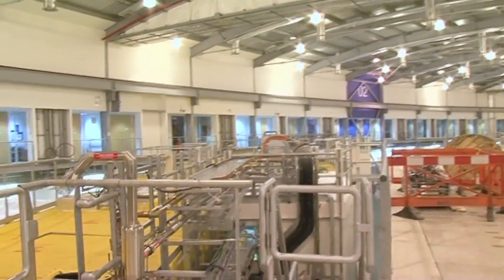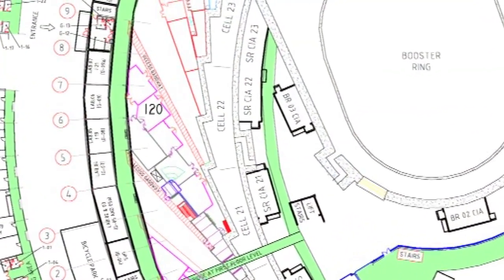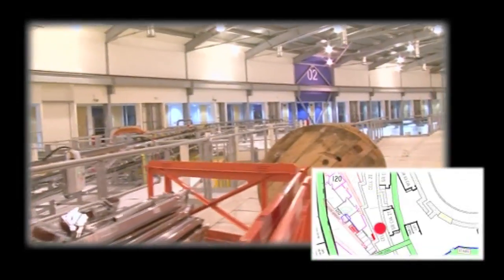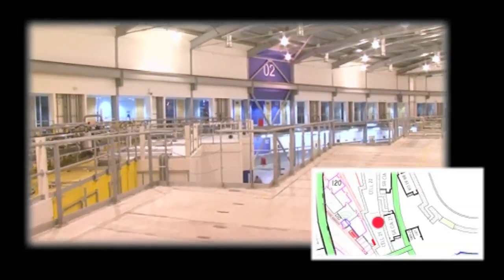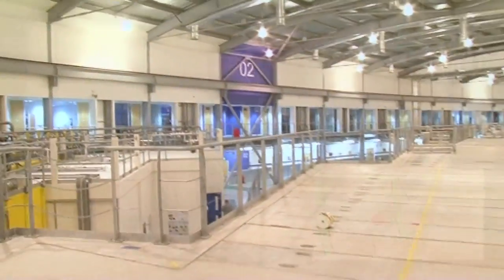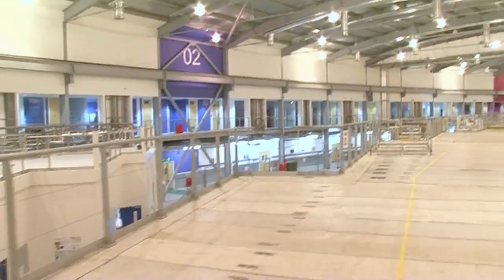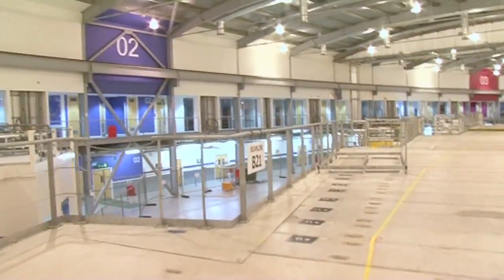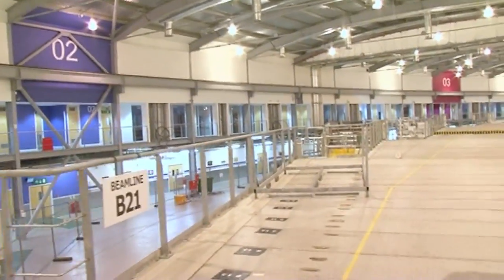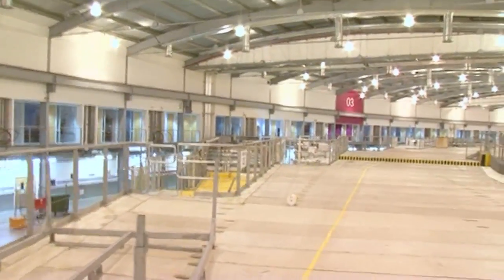This first beamline we're walking past is I-20, one of our newest beamlines that does spectroscopy measurements. Spectroscopy is a range of techniques where you look for chemical signatures from samples, so you can tell about the presence of metals or other elements. First you can detect them, see if they're there at all, and then you can learn something about their chemical environment, how they might be reacting with other types of atoms or elements around.